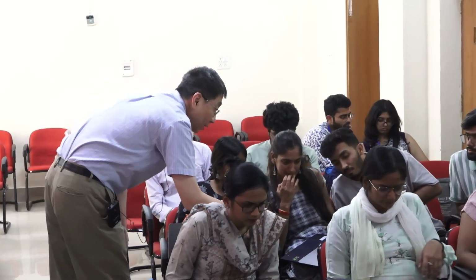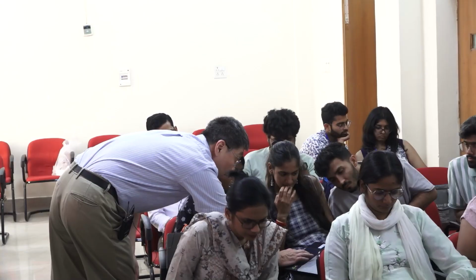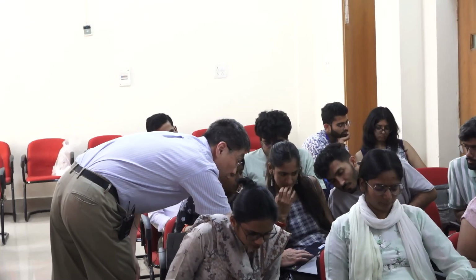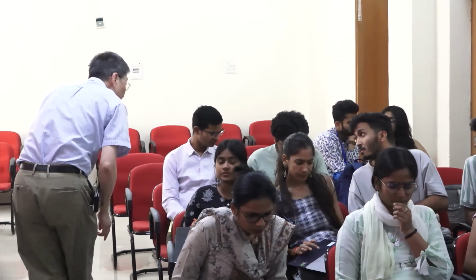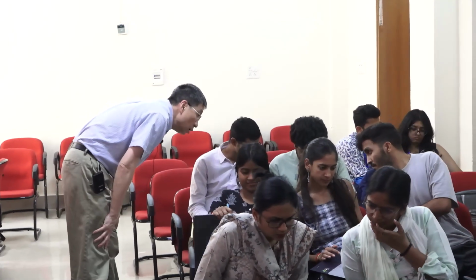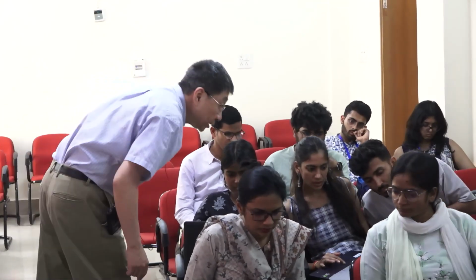So it should tell you what residue number that is. So let me go find out. Do you know what the residue number of the phenylalanine is? Can you click on the phenylalanine? What's the residue number? 169? Huh? 168. So go to 168 up here. 169, right? That's what I remember. So 169 up here.